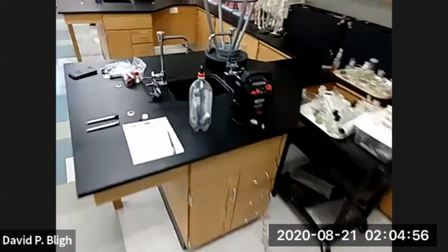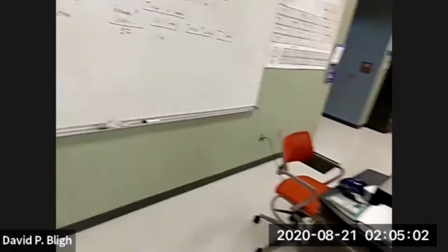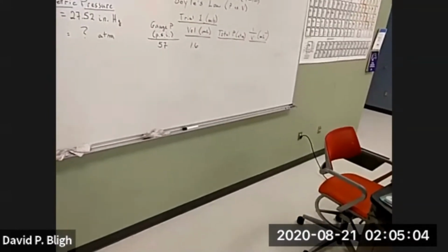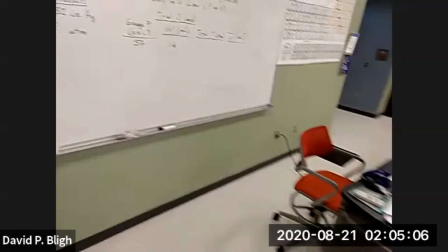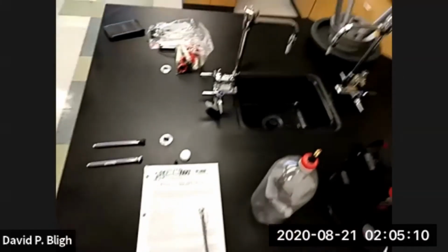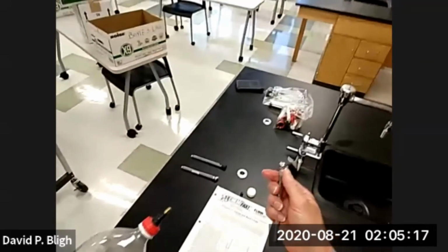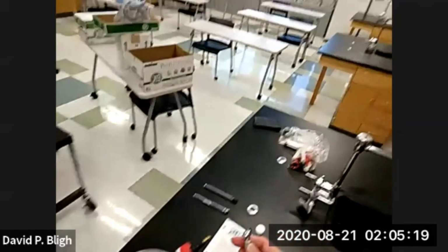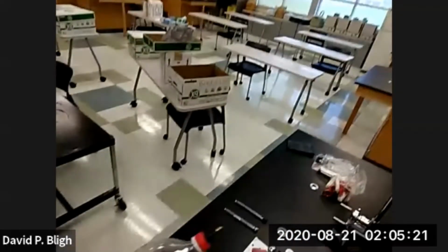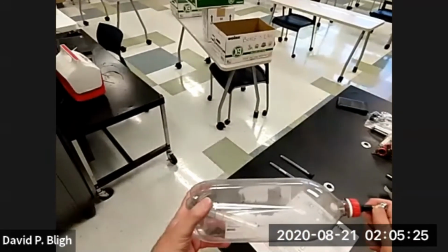Now let's do it again. What we want to do is have 10 or so readings at least. So we probably don't want to go too far past 50 psi. It'd probably be better to judge it by the volume obtained. So each one of these has a nipple on the back, and that's what you use to let the air out of your neighbor's tire when his dog craps on your lawn. So do that.